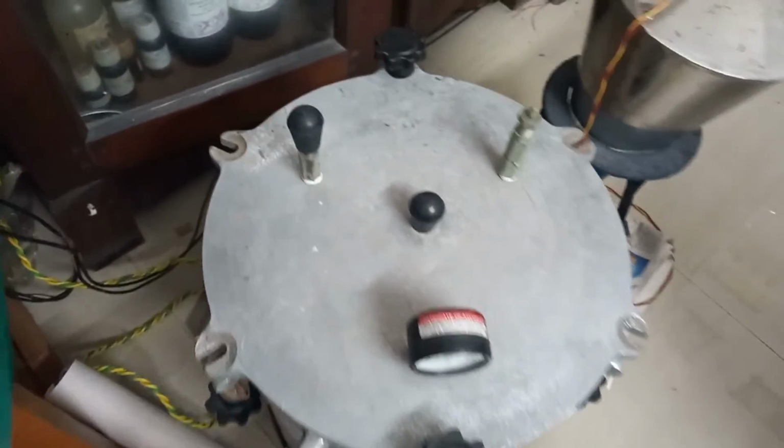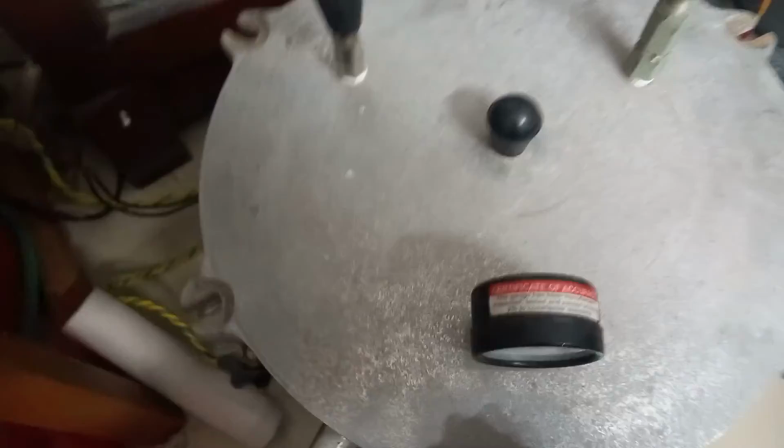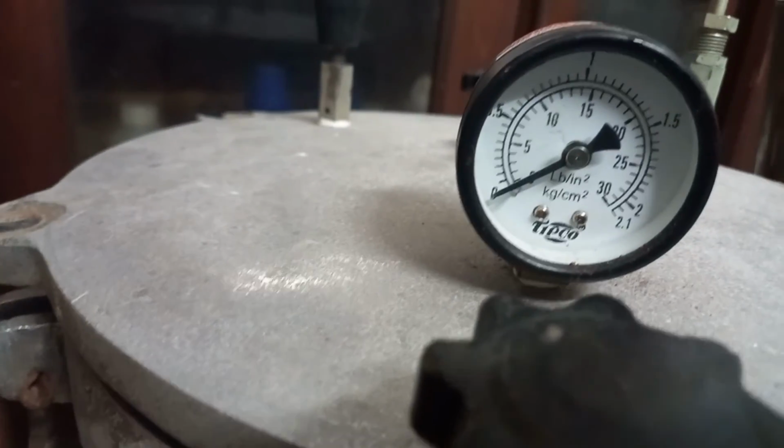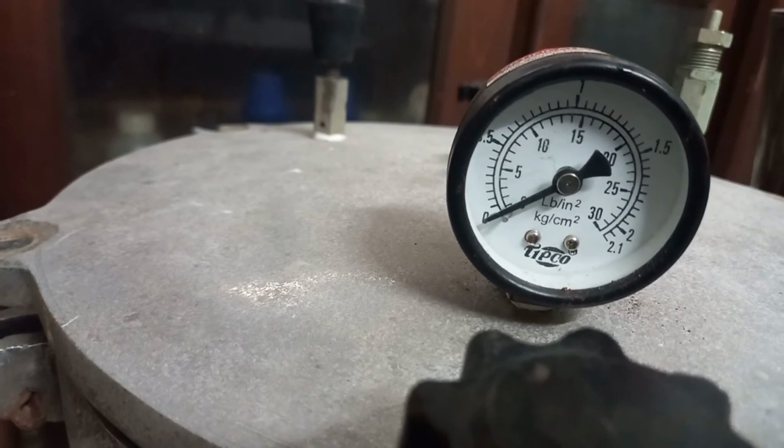Now, I have told you about the pressure. If you see the pressure gauge, the pressure of the steam is indicated in kg on this gauge. So you can increase it by a kg.